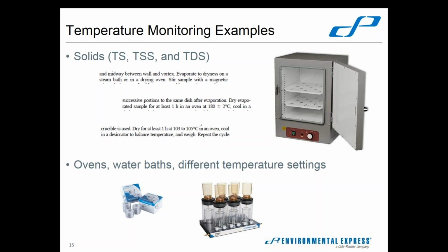I found best results when I've actually got my temperature set lower, around 30 or 35, because then I don't accidentally overshoot that evaporation and start burning off my residue once the hexane all disappears. So there's lots of wiggle room once you understand what the actual temperature requirement asks for, and if it's a requirement or a suggestion or just a practice that you've always done and never really considered.